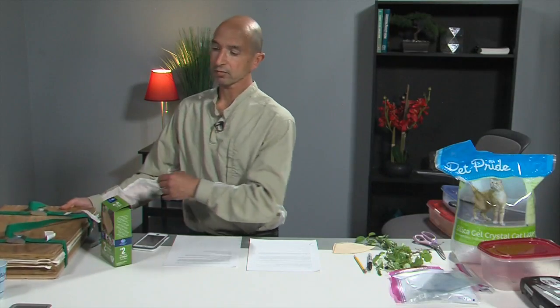So once in the field, once you know what needs to be collected, the first thing to do is to take your voucher specimen. I'll have some links at the bottom for those of you who want to see some examples of how best to make a voucher specimen in a plant press. Make sure that all the identifying information is not just on the sample that you collect for DNA, but you also have that on the sample in the plant press so that there's no confusion later.